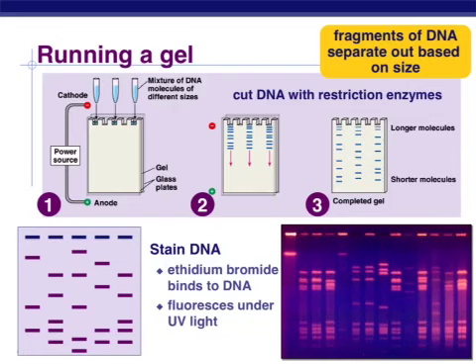Right, so here's a mock-up just to show you. This would be our power source right here, negative cathode, positive anode. Here we are loading our DNA into the wells. You let them run for a little bit, and then you see this separation. You see these bands. And then after a while, you'll see really good separation the longer you leave it. But after a while, you know that the shorter molecules will be on the bottom of the gel, whereas the longer molecules will be up at the top of the gel.